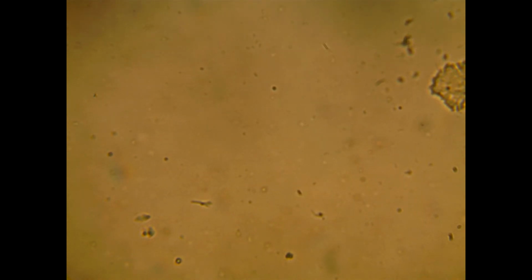And they're not moving, they're just sitting there, and you look at it at first and go, ooh, what's that? And then you realize, oh, I got a speck of something on the slide, or I got something on the lens. But anyways, look at all these guys. You can see them, kind of like in that very first sample that we looked at when this video first started. So I just wanted to share this. I thought it'd be pretty cool, and I wanted people to know that Keith does a really good job with the compost that he makes.